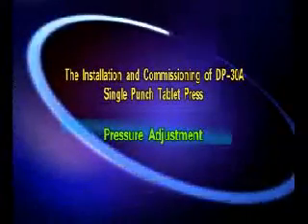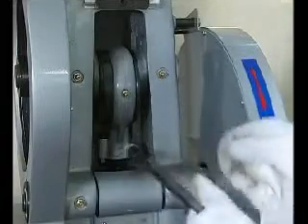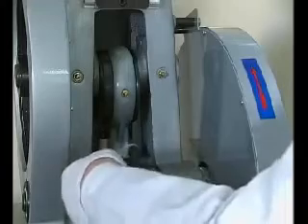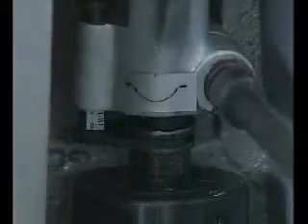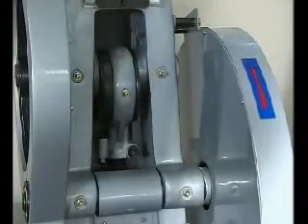Pressure adjustment. Loosen the fixing handle. Turn the hand wheel clockwise to increase pressure, or counter-clockwise to reduce it, adjusting tablet hardness as needed. Once the adjustment is completed, lock the fixing handle.